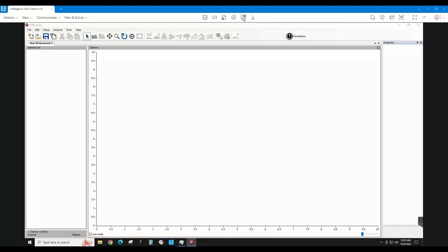Okay, everybody, I think you should now be seeing my screen. So I am projecting my screen. I'm actually connected remotely using TeamViewer to our demo system in Santa Barbara in California in the States.